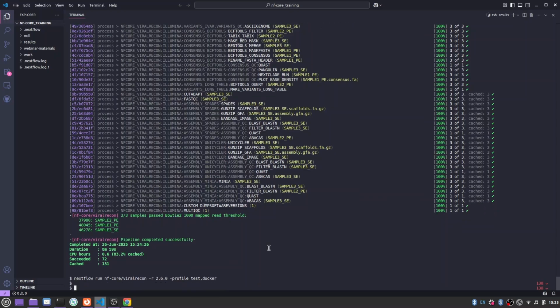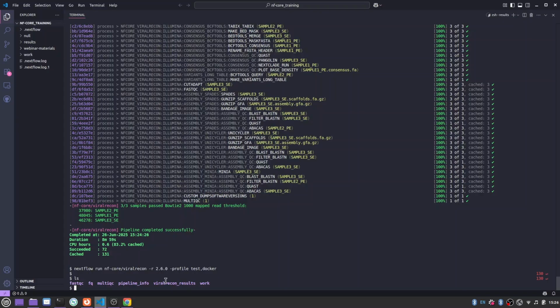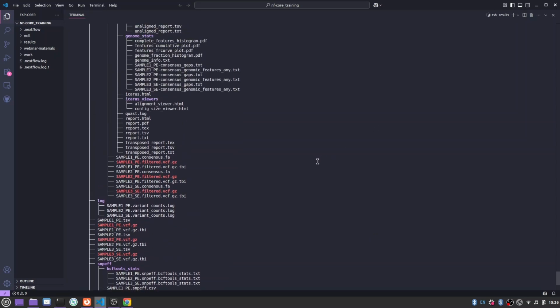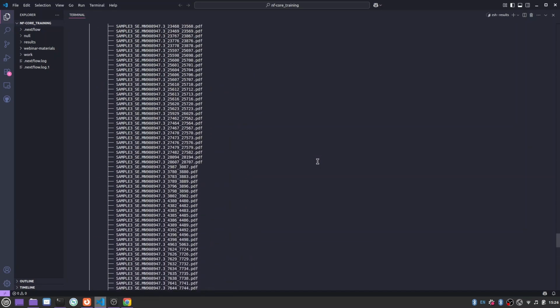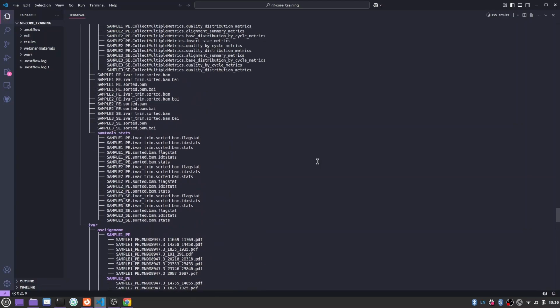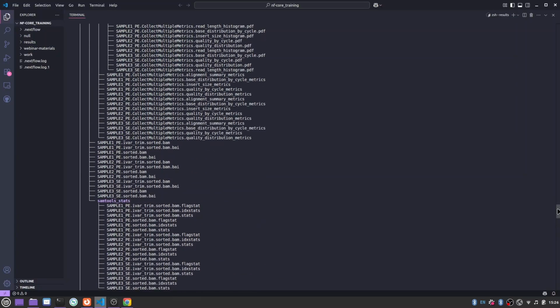And the results for this can be seen in viralrecon_results. So let's go ahead and use the tree command that I showed you before. So we're going to say viralrecon_results, and it will give us the full output of viralrecon. As you can see, there are many files here for you to find.